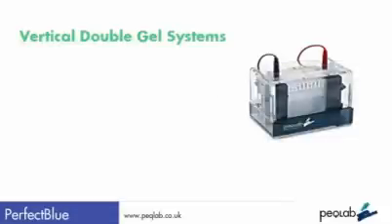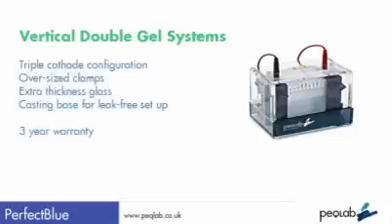Onto vertical systems. Perfect Blue Vertical Double Gel systems are designed for high-quality, reliable protein or nucleic acid separation with a triple-cathode configuration. They are also designed very much with the user in mind: oversized clamps, extra-thickness glass, a casting base system for the quickest leak-free setup available, and of course a three-year warranty.